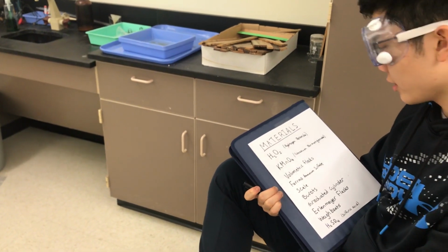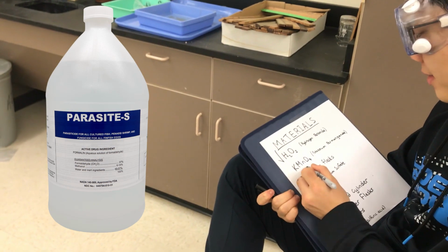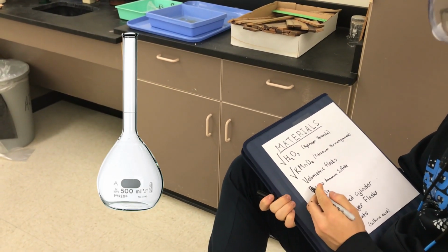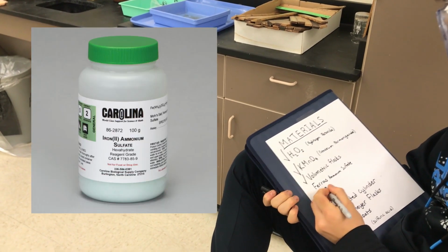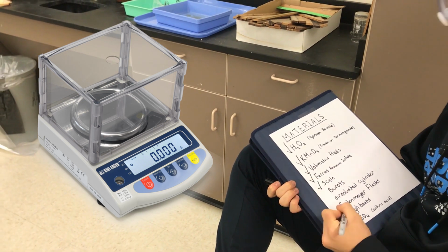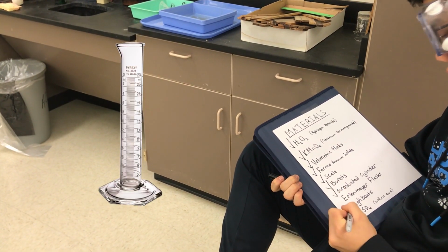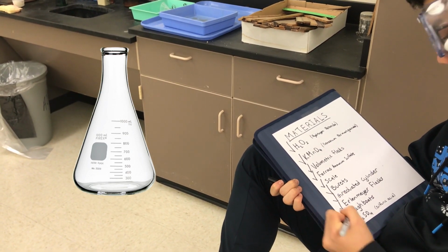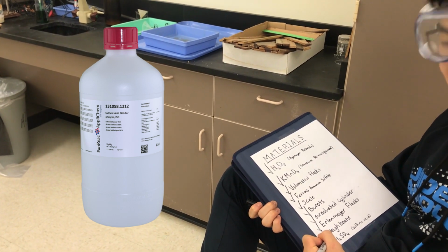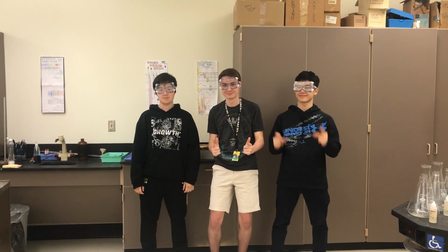So the materials we'll need are H2O2, hydrogen peroxide, KMnO4, potassium permanganate, volumetric flasks, ferrous ammonium sulfate, a scale, 2 burettes, a graduated cylinder, a couple Erlenmeyer flasks, some weigh boats, and lastly H2SO4, sulfuric acid. And don't forget to wear your safety goggles.